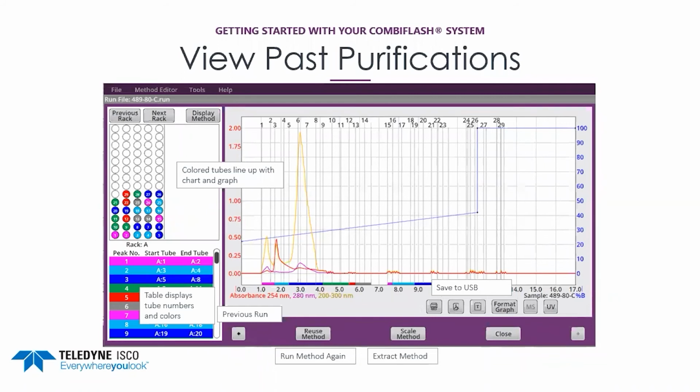There is a depiction of the collection racks where the colored tubes match the bars under the fractions in the chromatogram. We also see a table showing the peaks and which tubes contain different peaks. The arrows at the bottom allow a user to look at other chromatograms on the next-gen system. There are 2 buttons that allow a user to save data as a PDF file or as XML text to a USB drive.